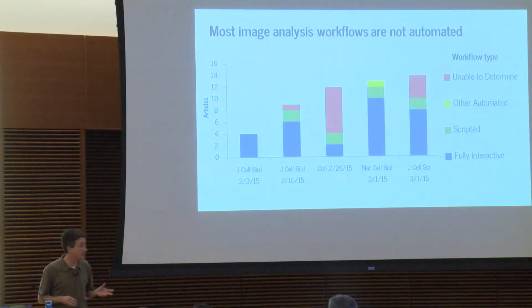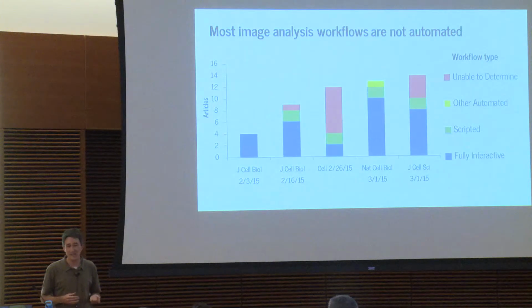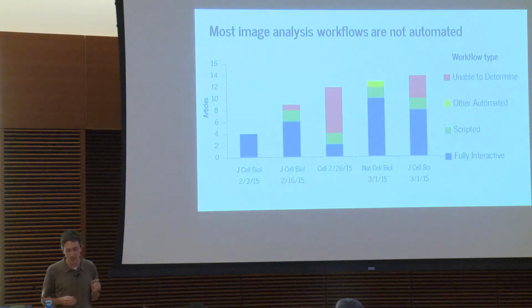Now, in the life sciences and in cell biology, most data sets are actually not that big. We get excited about really big data, but most experiments have dozens of images, not tens of thousands. They also use analyses that are relatively simple, such as just calculating the average pixel value in a region. And then the problem of segmenting a region of interest isn't really trivial. And for a small data set, it may just be simpler to do it by hand.